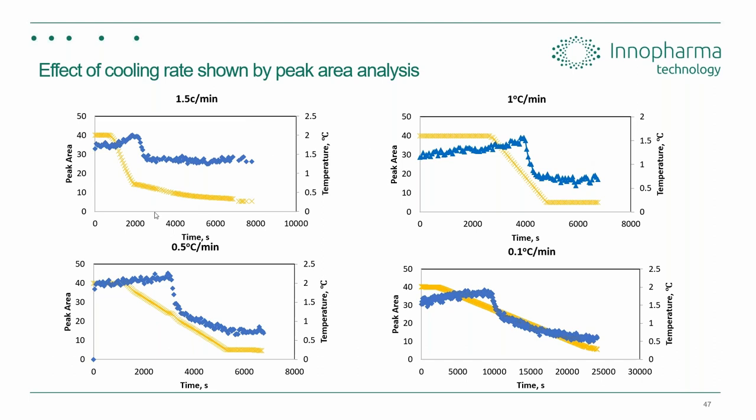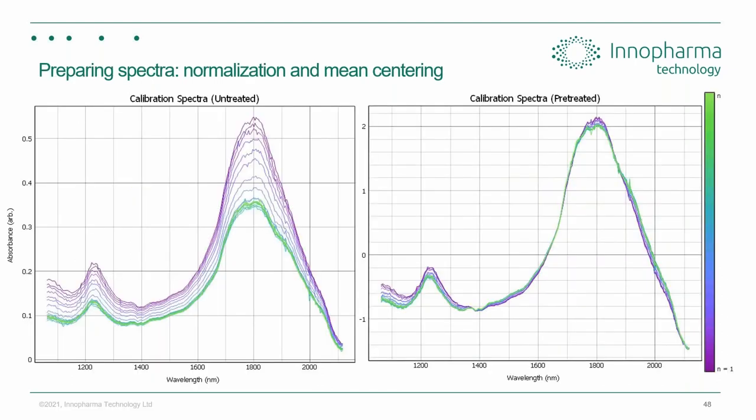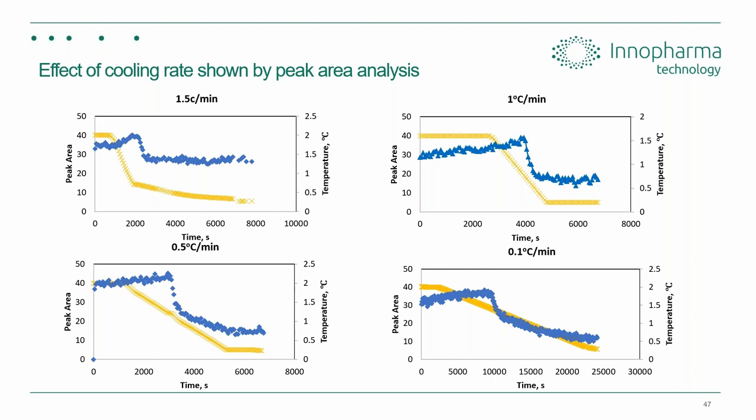Okay, so even something as simple as removing the background and focusing on one specific peak allowed us to map the changes in concentration. That kind of simple analysis can be done as well using a type of regression known as principal component analysis. I'll get into more detail on principal component analysis during the lecture. Suffice it to say for today that it is a way of reducing the number of dimensions, reducing the complexity of the information to a simple form to do a simple kind of analysis like this.